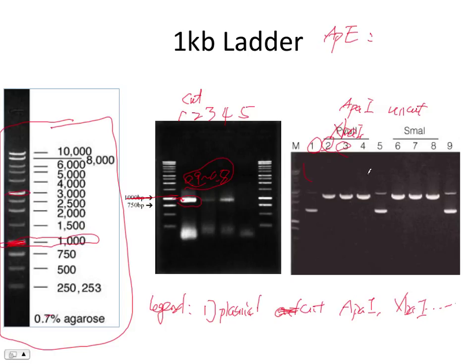You may have loaded it in the wrong lane, or you may have switched cut and uncut. Or you just say: I don't know what happened, but I was supposed to see this and I didn't see that.